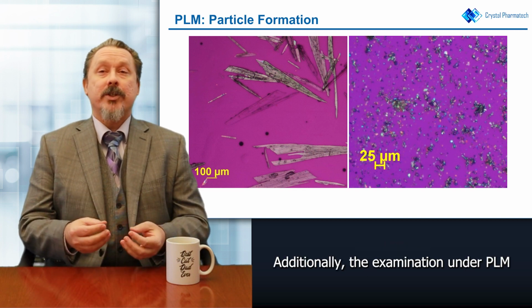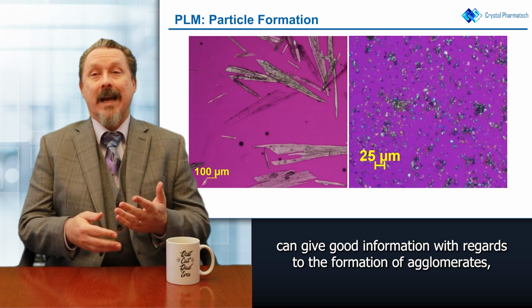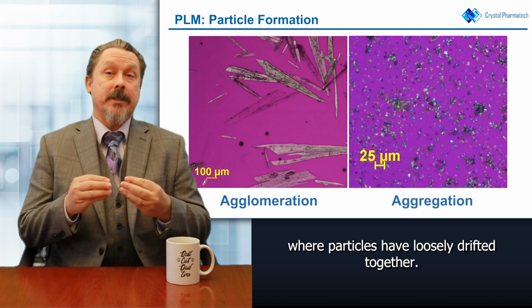Additionally, the examination under PLM can give good information with regards to the formation of agglomerates, where particles are fused together, or aggregates, where particles have loosely drifted together.